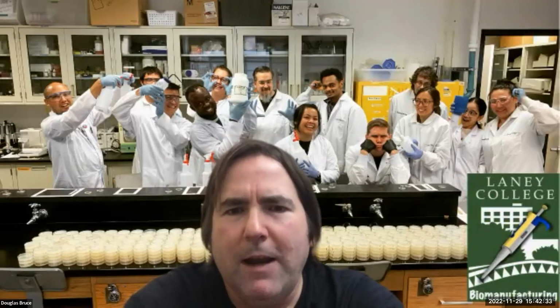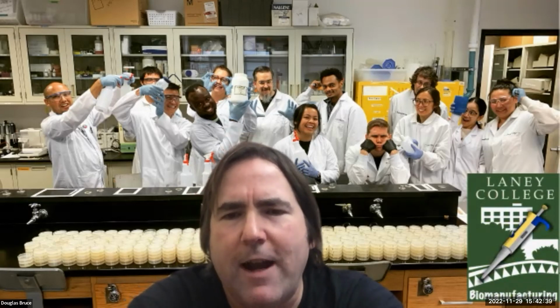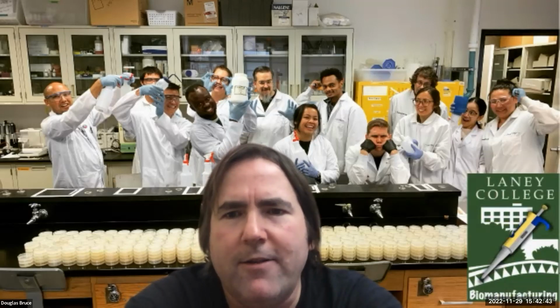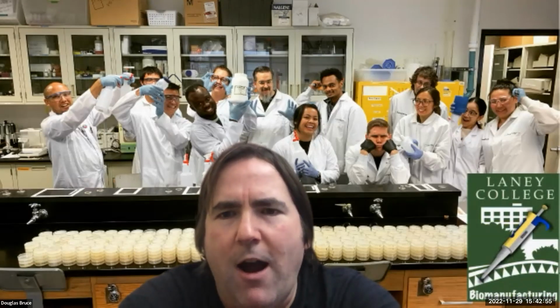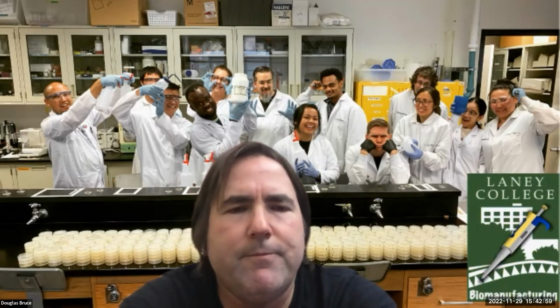Great, thank you. My last question is, one of the products you mentioned on your product list was yeast extract, and you had a couple others on there that are pretty low value products. When you have a very low value product like yeast extract, where the cost per gram or kilogram is pretty low, what do you recommend for considering membranes in terms of cost? Like, what's the most cost effective way to approach membrane filtration?